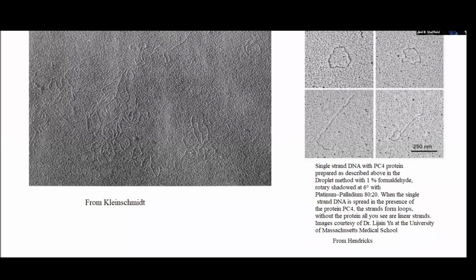As you can see in this picture, it's been a little hard for me to show you these images because when you download the papers now, the copies in the digitized versions aren't very good. I've modified this one a bit so that we can actually see here this line that represents DNA. And you can actually see that it curls around.